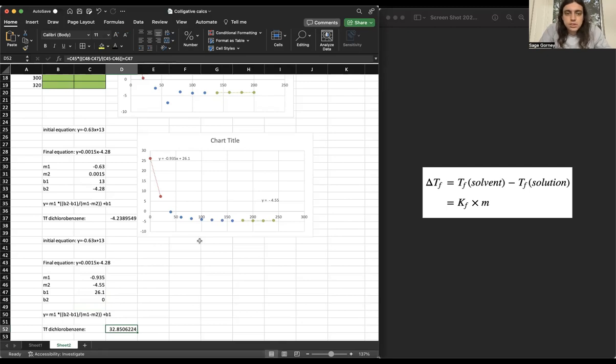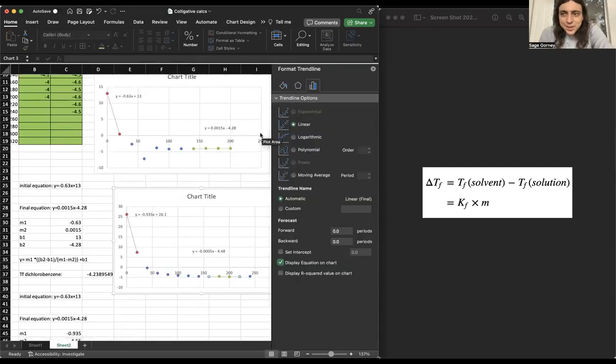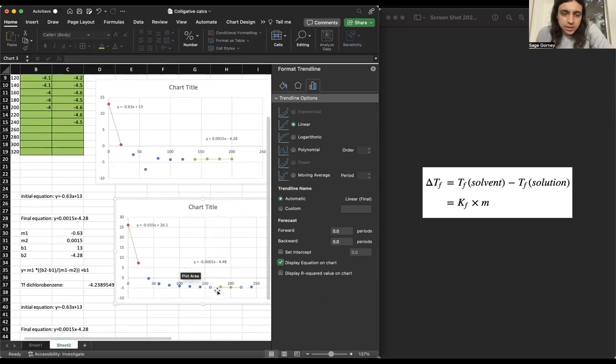And it's giving us weird data. So something's wrong. Hold on, I'll figure it out. Okay, figured it out. I don't know why it didn't like that last data point. So I just shifted it back one, using the 5th to second to last data points. And it likes that, I guess. And so we're going with that.